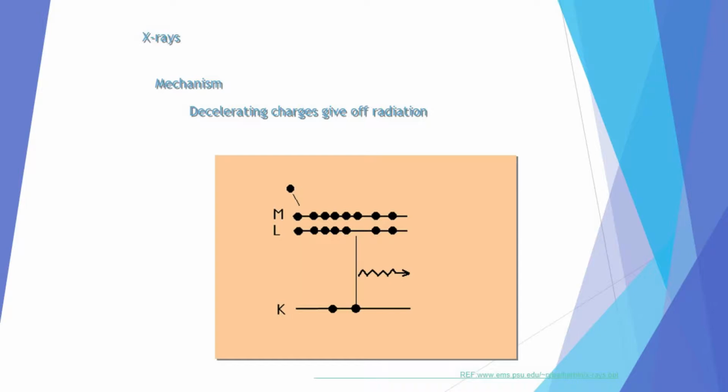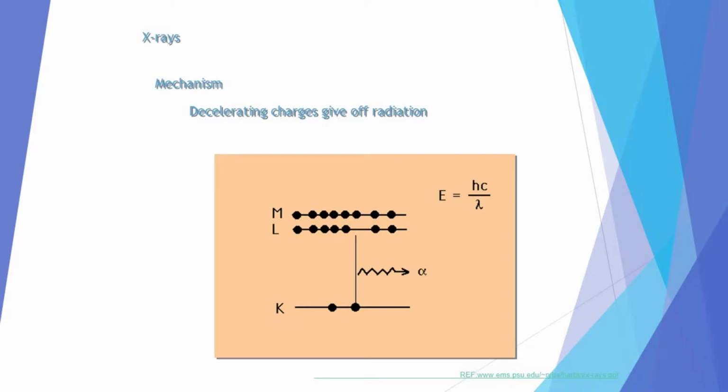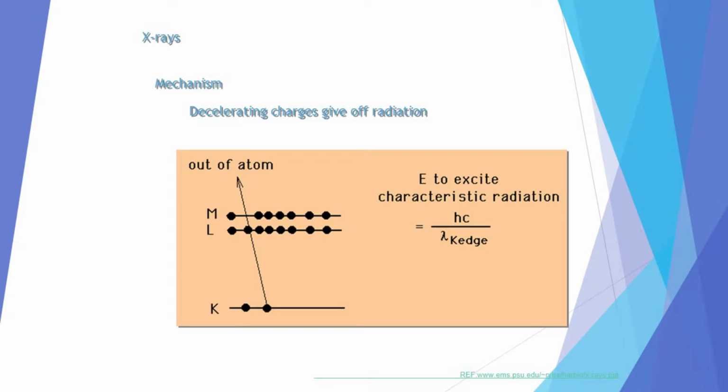Now you can see that the thermionic electron is coming and it hits the K shell of an atom. Now, the electron from the K shell escapes and the electron from the L shell takes its position, leading to the energy which is called K alpha. And secondly, if an electron hits again the K shell and an electron from the M shell falls, the radiation will be K beta. And these radiations are characteristic radiations which are very useful in the spectrum.